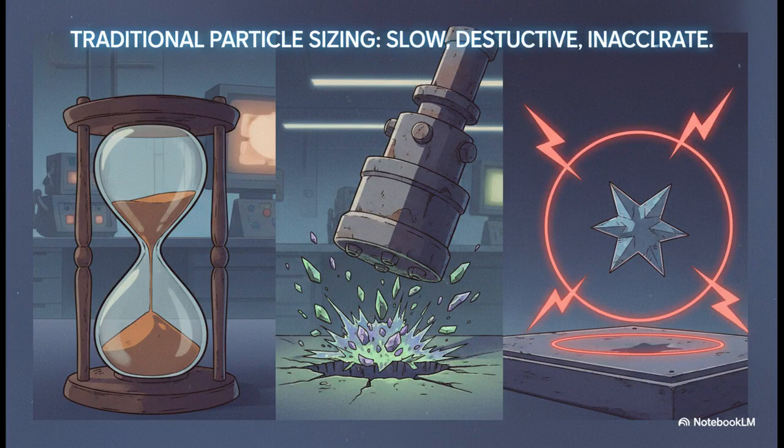You see, for a long time, the tools scientists had were, well, kind of clunky. Some would literally destroy the sample they were trying to measure. Others took forever to run, or, and this is a big one, they made scientists guess the particle's shape, which could throw the whole measurement way off. So clearly, they needed a better, more direct way to understand this invisible world.